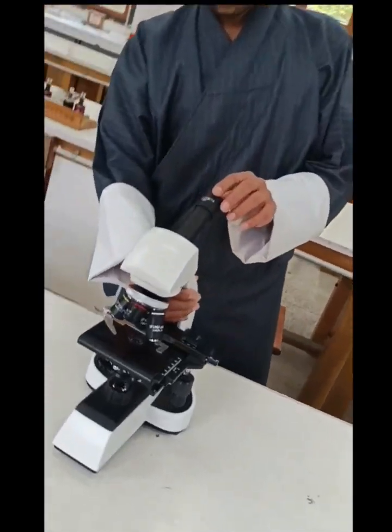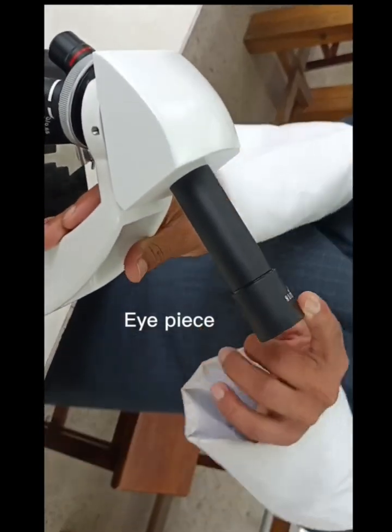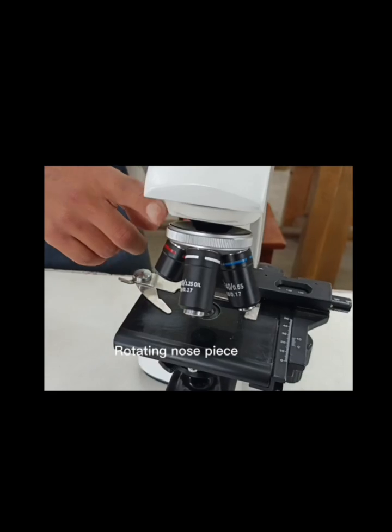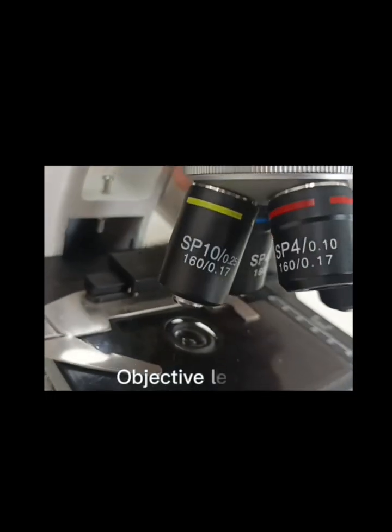Firstly, it consists of the eyepiece. This is the eyepiece. Now followed by the eyepiece, this is the rotating nose piece. This rotating nose piece is connected with the objective lens.